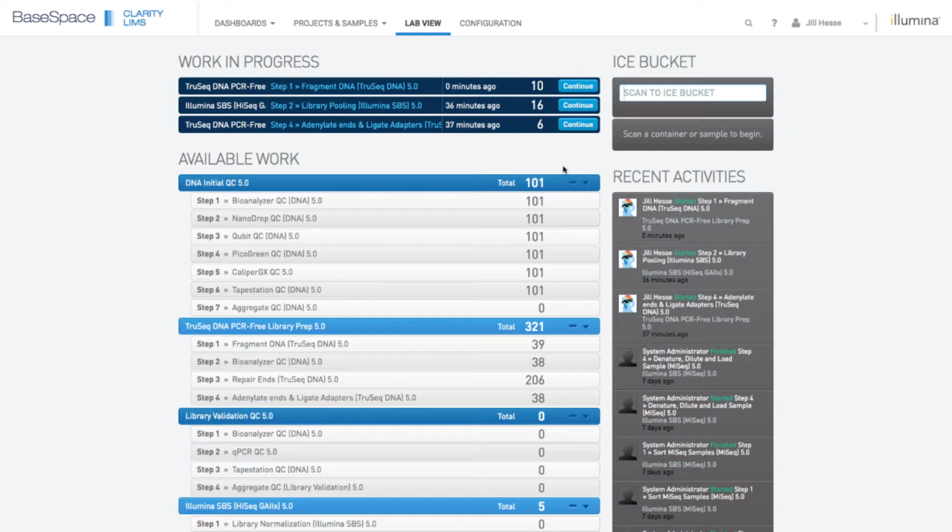Out-of-the-box integrations and pre-configured protocols provide a lot of power to our LIMS user. Pre-configured protocols are based on the manufacturer's recommendations about what steps you should take, what calculations you should perform, as well as what reagents you should use. So instead of having a blank LIMS when you begin, using these pre-configured protocols can get you up and running much quicker. In a similar way, out-of-the-box integrations allow you to automate some of those more mundane data moving tasks.